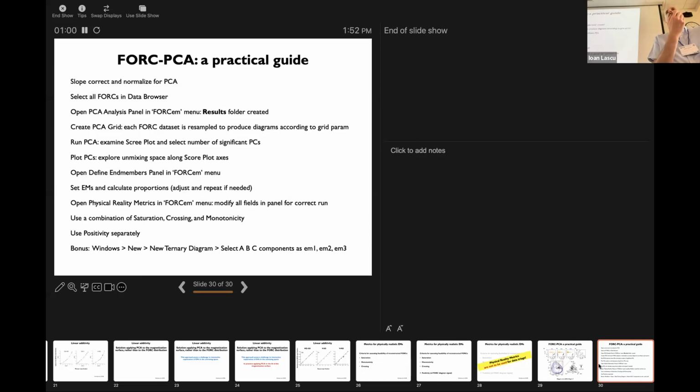Yeah, I think you can, but you would have to create a new wave in which you establish some kind of scale, let's say, that goes from 0 to 1 or whatever, and then assign a color or a size of the data point to represent that scale.